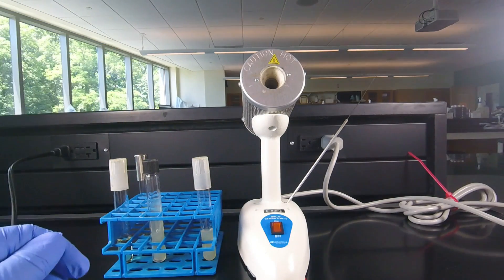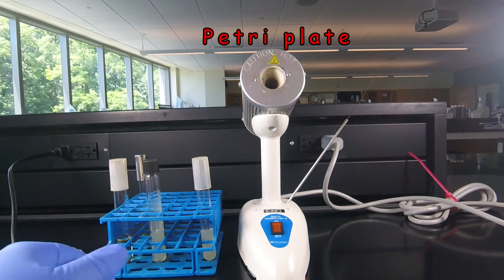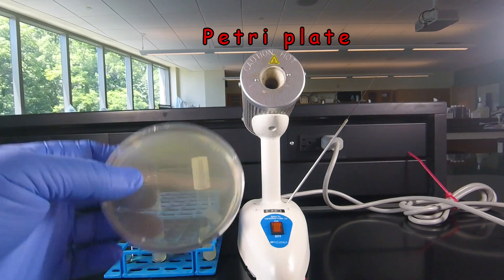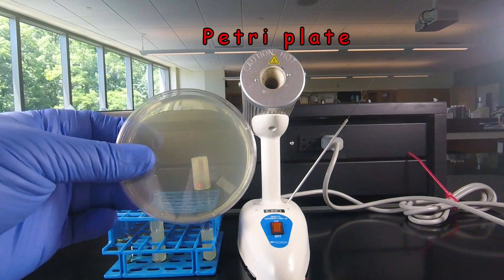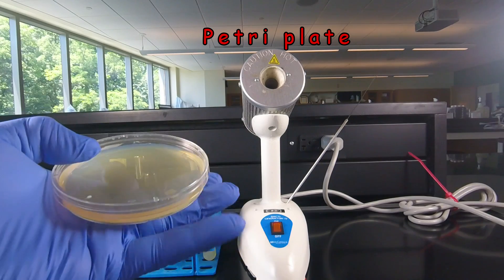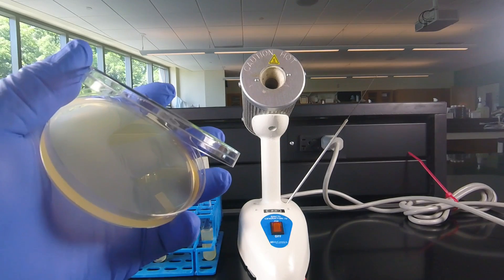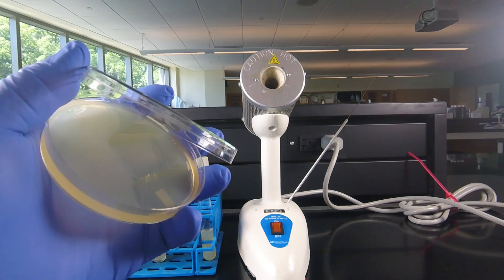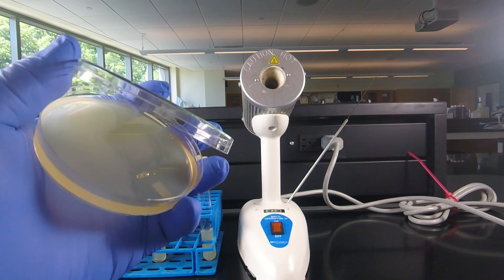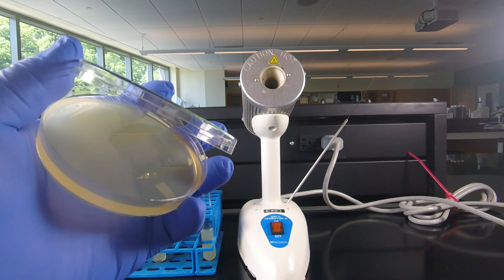And finally, and most frequently, we grow the bacteria on petri plates, such as we see here. The petri plates are nice because they provide a nice solid surface on which to grow microorganisms. And these are especially useful for separating bacteria to get isolated colonies that we'll be talking about in a later lesson.